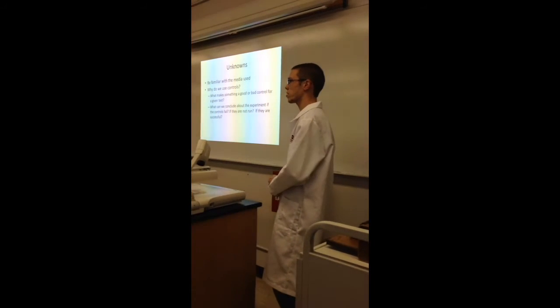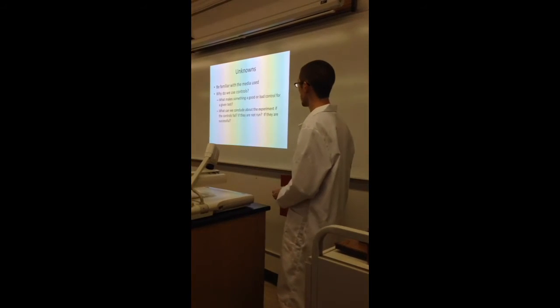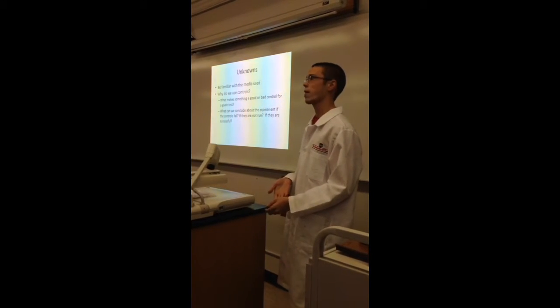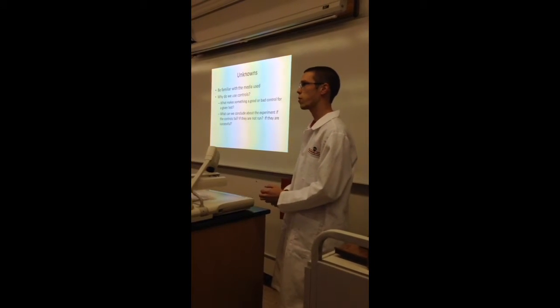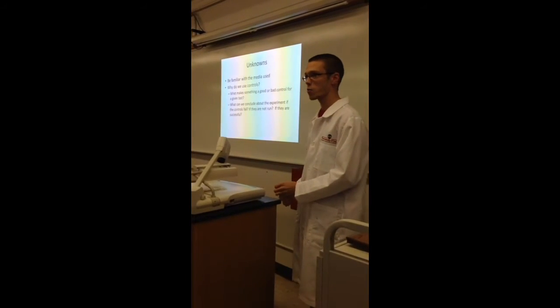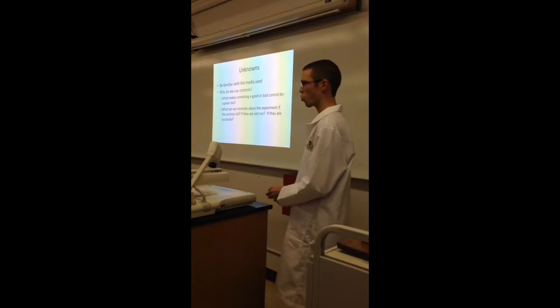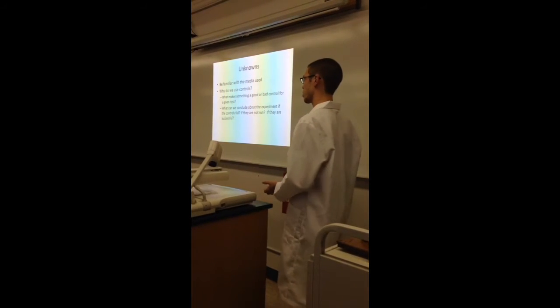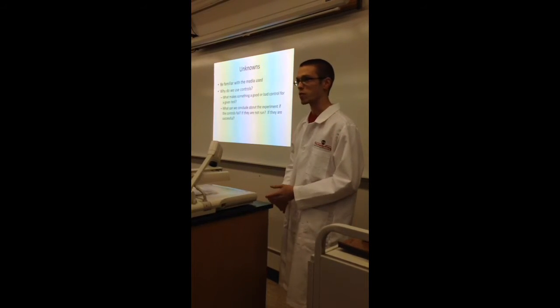So you will also be tested on the unknowns in sort of a broad sense. Things like the media that was used, we just went over a lot of that. But you should be familiar with most of the media that you've used throughout the unknowns. And why do we use controls? This is probably one of the biggest sticking points for the practical. So what makes something a good or a bad control for a given test? And these are just rhetorical questions at the moment. So that depends on the test, obviously, right?